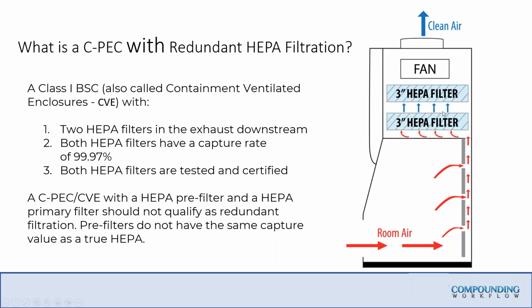But I don't personally like connecting hoods. Many moons ago, when I was in the engineer containment, which is a fancy name for the hood business, I did not like to see people connect hoods to exhaust systems because they're fickle. Whenever these HEPA filters start to get full with powders, the pressure drops. And this is a constant volume fan, not a variable speed fan. Sorry, I had to take a swallow of water there. They will start to impact what is happening with that negative pressure.